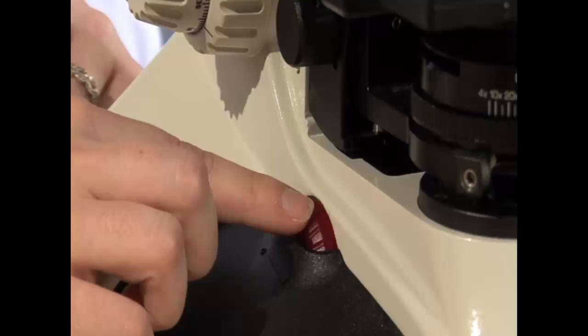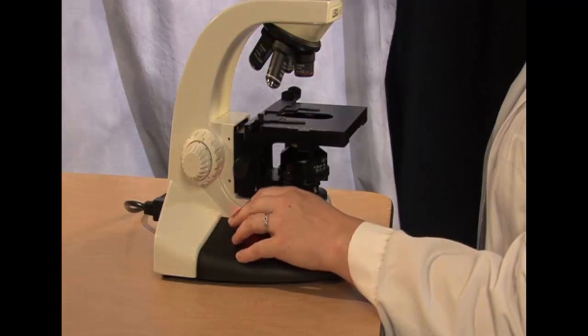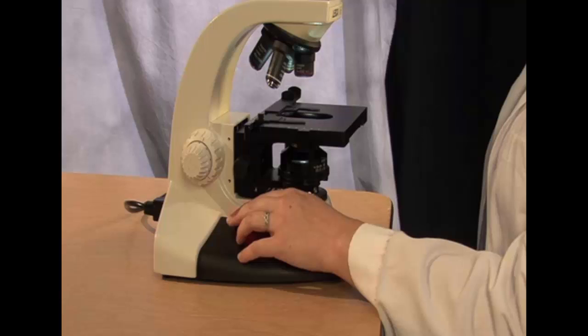For our specimen, we will be using a prepared letter E slide. Start by turning on the light at the bottom of the microscope, and to get the best contrast, adjust the light so that it is not on full power.